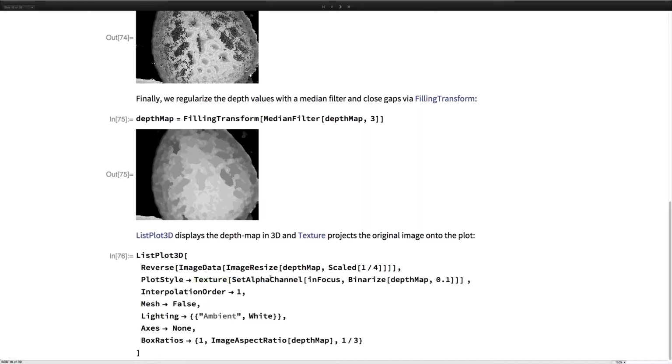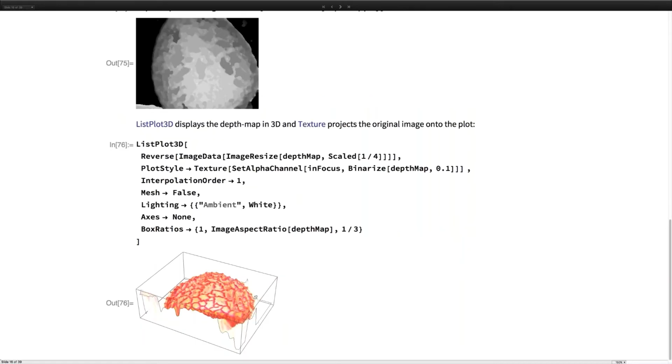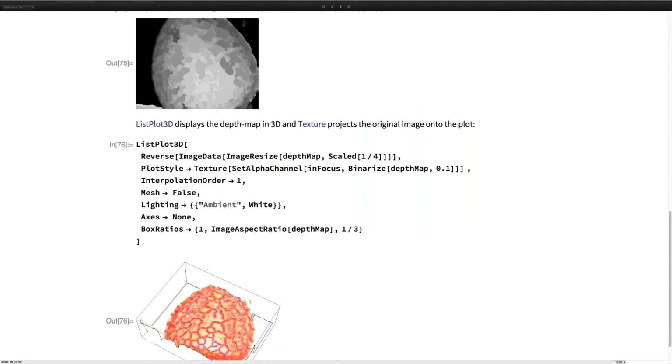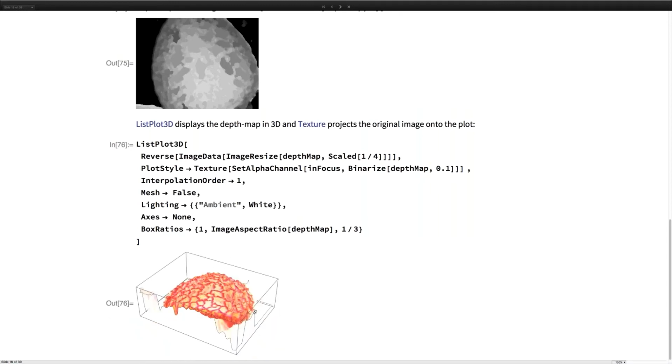Okay, and once I do this, I very quickly get now our 3D model just reconstructed from the lack of focus, or due to the fortunate fact that the depth of field is very shallow, and that this helps me to actually even gauge the Z component, to measure the Z component of a specimen, not just to visualize the X and Y component.